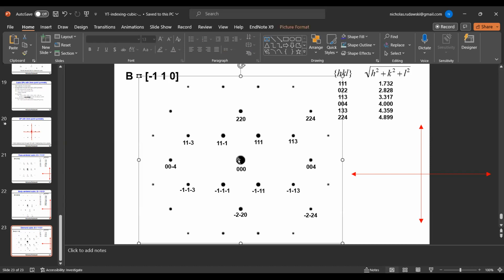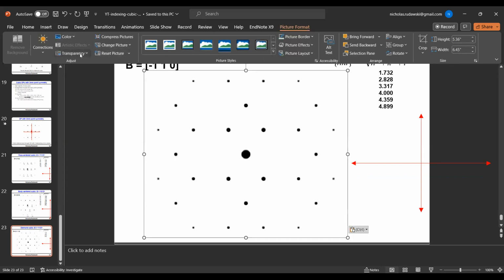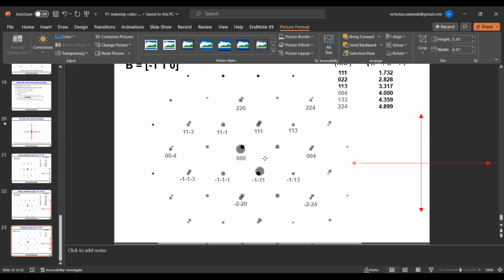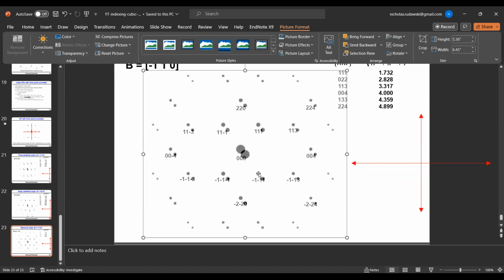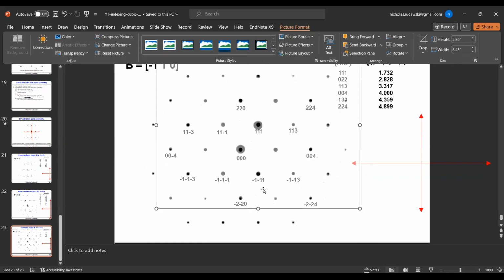So to show you how this works, give you kind of an extra lesson here. So I'm going to copy this pattern here, and then I'm going to make it transparent so you can see. So let's assume right here, okay, let's assume that this spot where my mouse is, actually, let's use 1, 1, 1 since that's easier. Let's assume that this is strongly diffracting, and this serves as an incident beam. If I shift the whole pattern up and superimpose it on the other pattern, my holes get filled in.